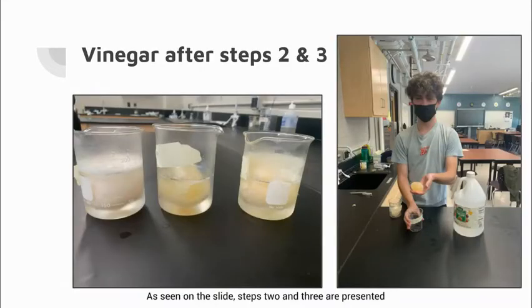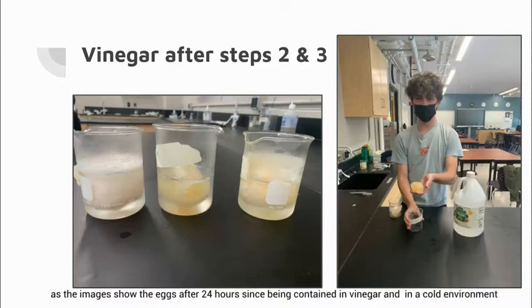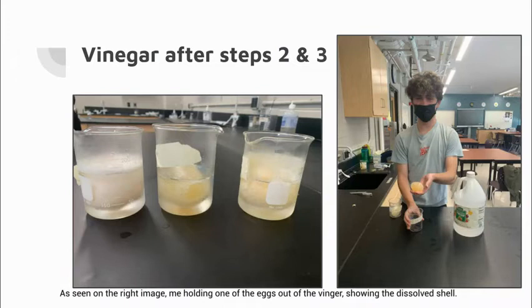As seen on the slide, steps 2 and 3 are presented. The image on the left shows the eggs after 24 hours contained in vinegar and in a cold environment. As seen on the right image, me holding one of the eggs out of the vinegar, showing the dissolved shell.